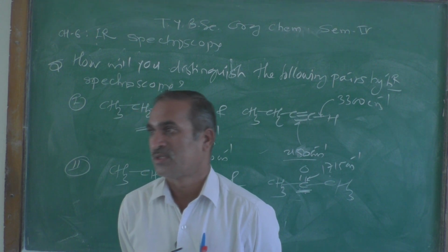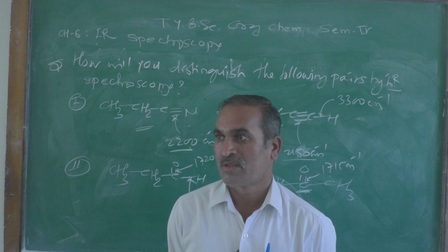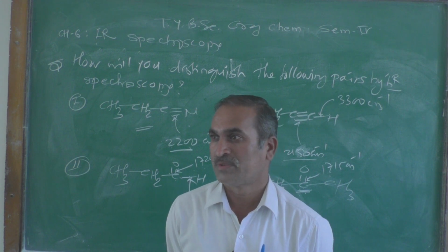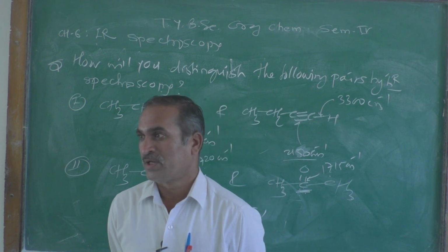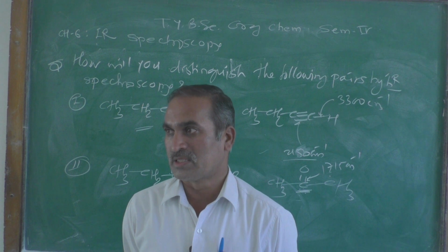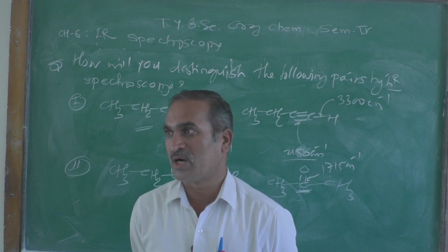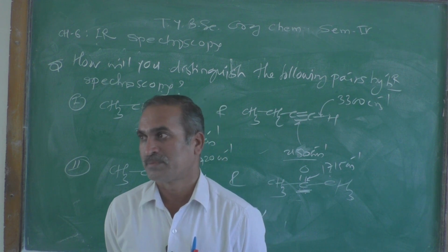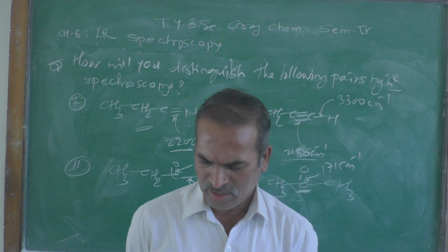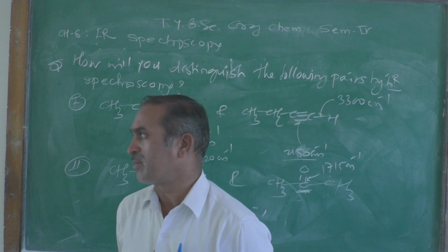Functional group, fingerprint region and the aromatic region. With respect to these 3 points we have discussed this point. And second, study of progress of chemical reaction.